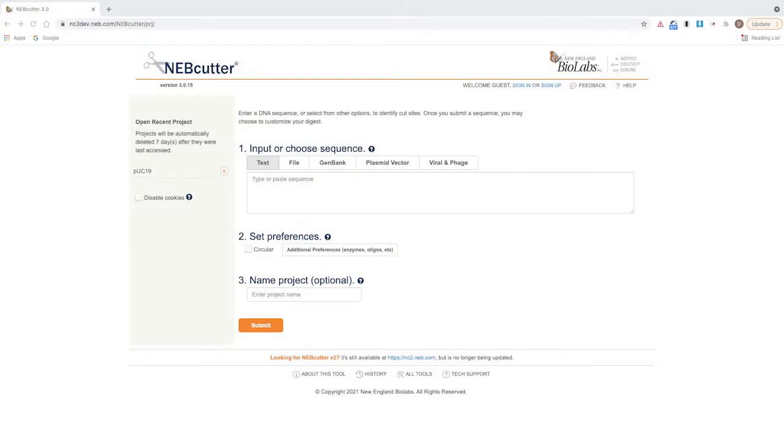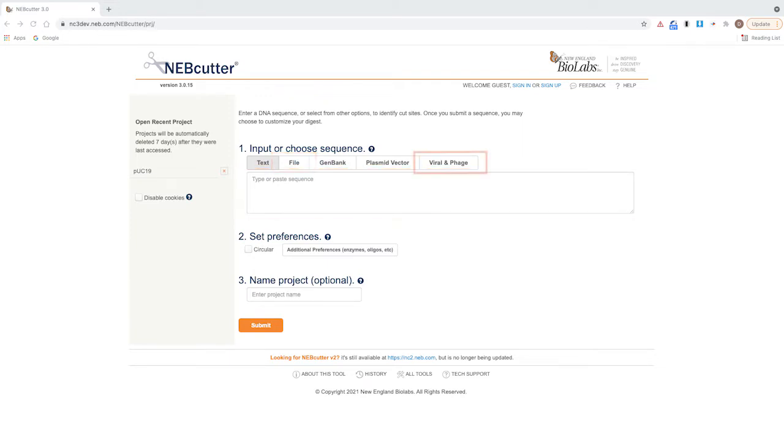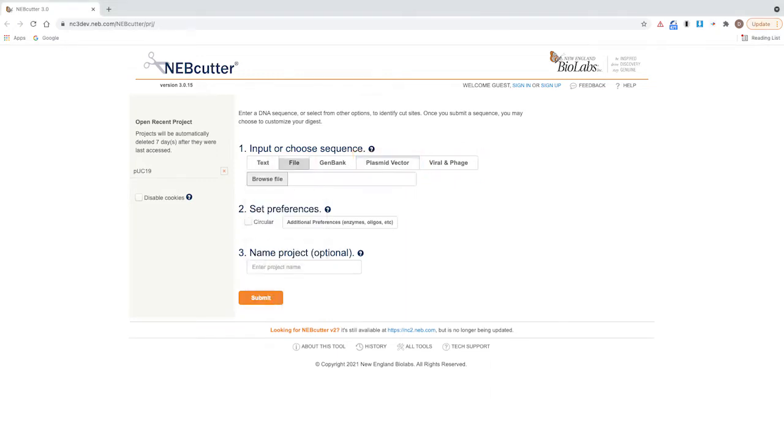First, enter your DNA sequence into NEBcutter. You can either paste, upload, or choose from one of the preloaded sequences available in the tabs. You can also select a sequence from a previous project.